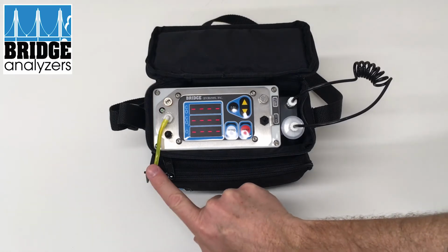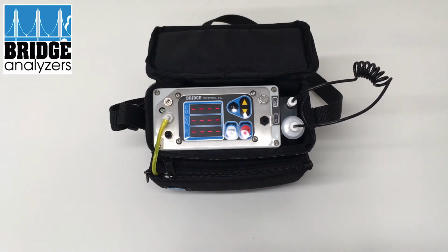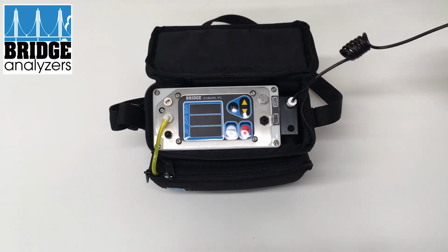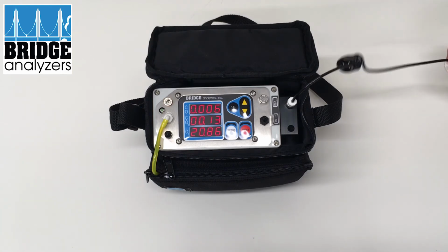So at this point, it's now drawing through here ambient air and resetting its reference levels. One little trick I would recommend is that when you zero, go ahead and take the analyzer, put a septum on your package, and put the needle in the package. Because what happens is, after it zeros, it'll do a single test when you're in the discrete testing mode. And you can see it's doing one right now. When it finishes the test, the pump will turn off, and you've completed a test.